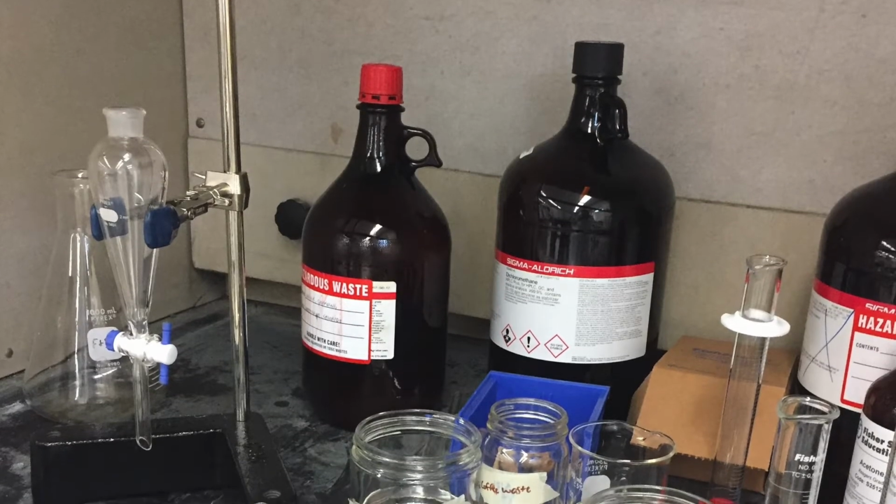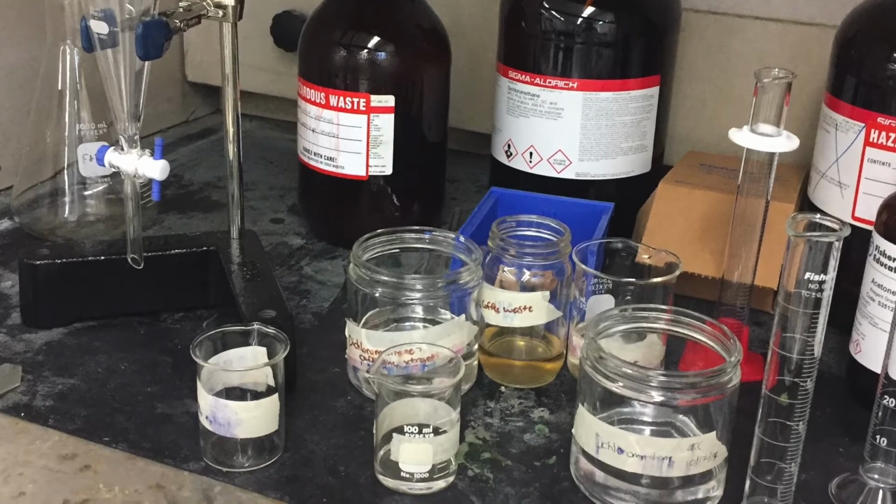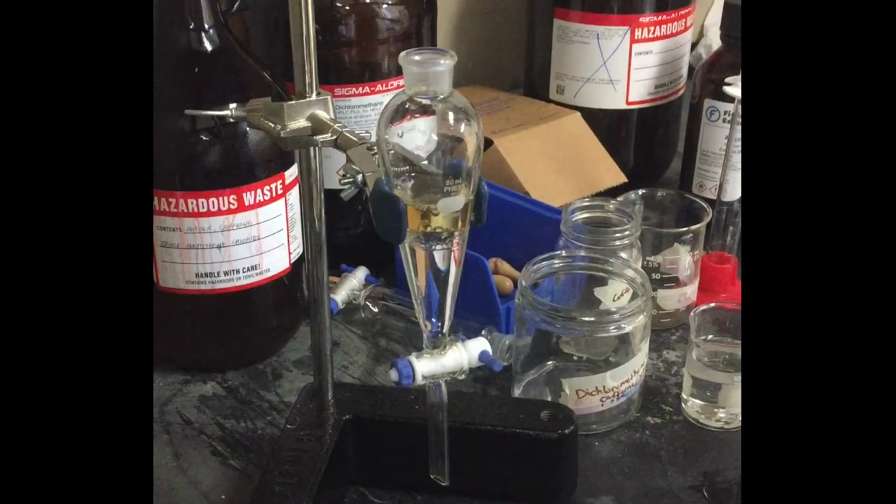In this lab, chemical extraction is used to separate caffeine from the coffee grounds. In theory, caffeine is more soluble in dichloromethane than it is in water. Coffee grounds contained in tea bags are placed in deionized water so that caffeine is allowed to leach into the aqueous phase from the solids. When the aqueous phase is combined with dichloromethane in the separatory funnel, caffeine is expected to pass into the organic phase because of the solubility preference of caffeine.